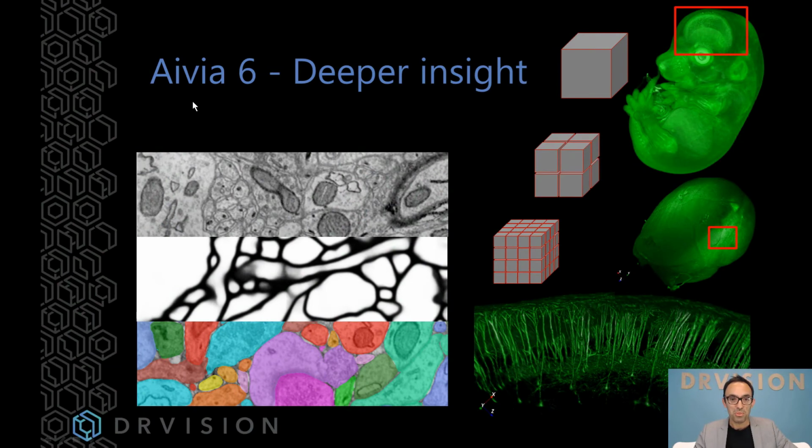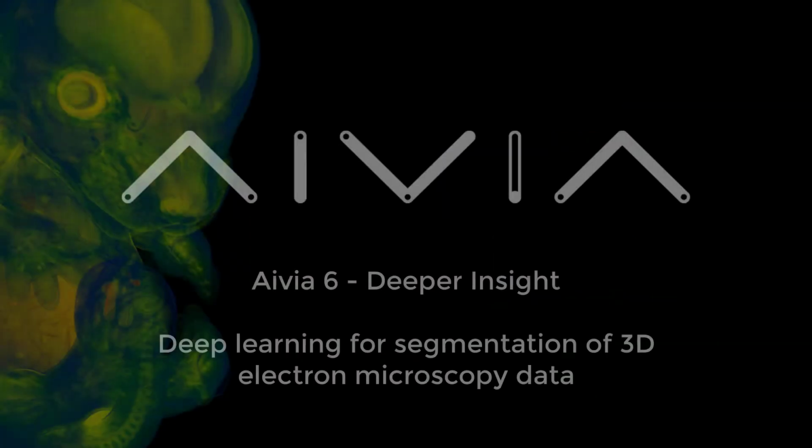All right, so the main two features we're going to be talking about today are the 3D EM image segmentation, which I have some images here. This middle one doesn't look like EM. That's a confidence map created from our deep learning model. And we're going to be talking about this new volume rendering engine, which uses multi-res, multi-block technology. And Sean is going to talk about that in a moment.